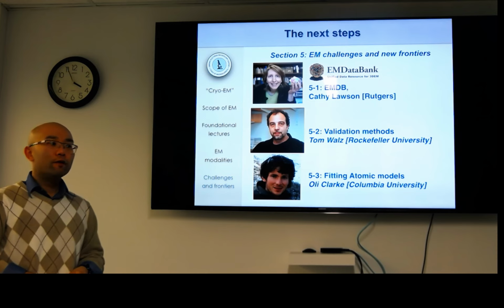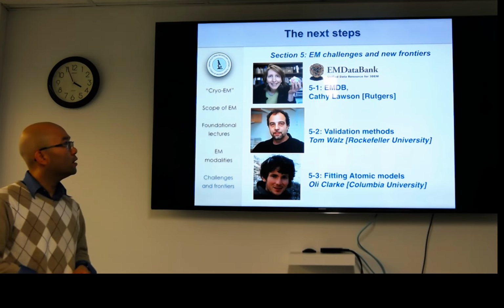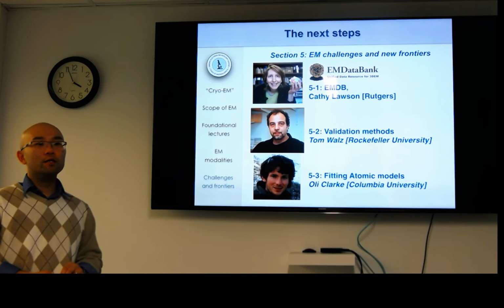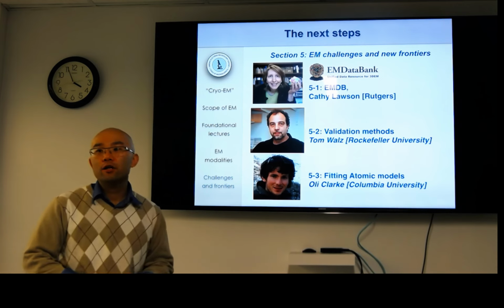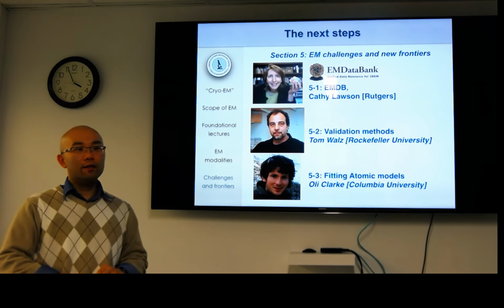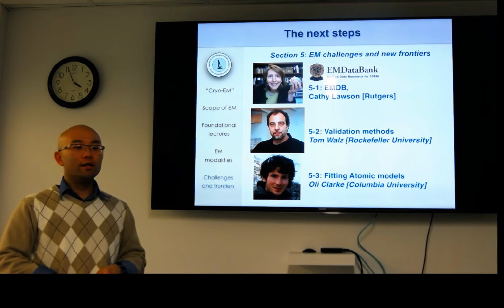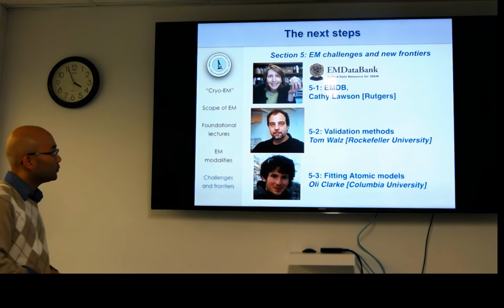And this is going to be very useful because as you're reading papers, you would want to see the reconstruction, you would want to see the preliminary data. We have a challenge with our raw data: do we want to save the raw data in an archive or not? If you look at some of our direct detectors, we average somewhere around 1.5 terabytes of raw data per microscope per day. And that becomes a challenge if you just want to get the raw data and reprocess it, because there's very little data reduction. Our data are images, and you can only reduce images so much.